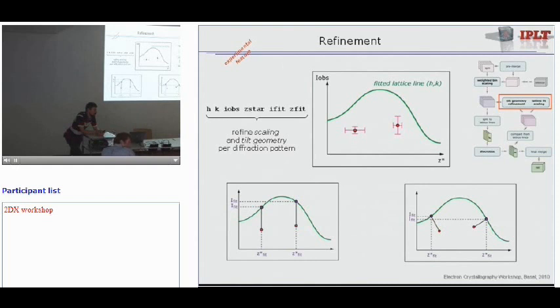Right. It's basically, if you're going to scale it by image, then it seems to make sense that what you would be doing is refining your tilt geometry. In other words, you are refining your tilt angle when you are doing so. So that's already been covered in the other way. So it probably would not make sense to separate it out in that way. Maybe that's why it didn't improve. Yeah, this might be the reason.